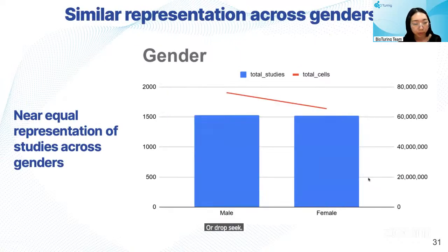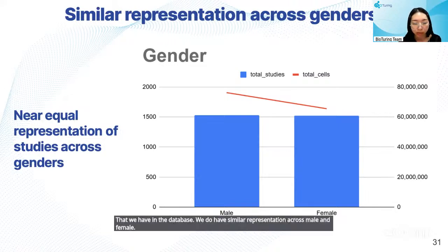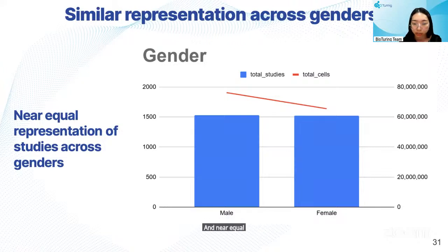Okay, this one's pretty simple. You'll be able to see the different genders that we have in the database. We do have similar representation across male and female, and near equal representation of the studies between male and female samples.